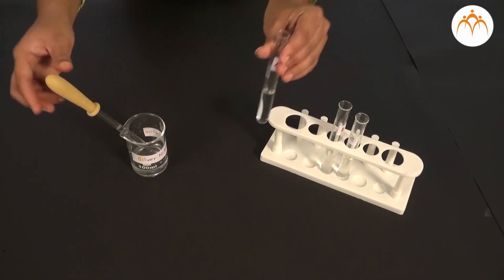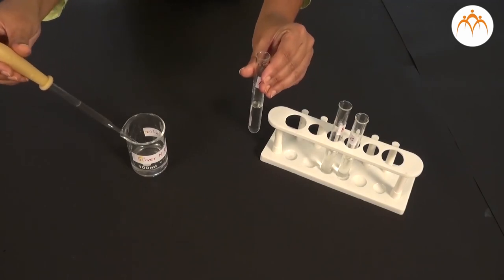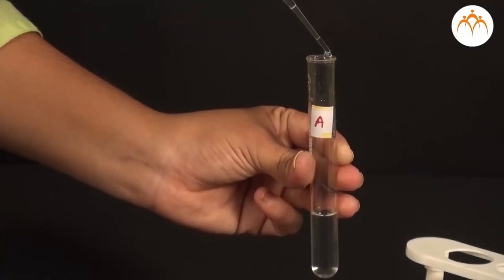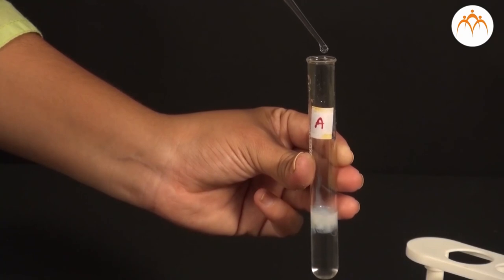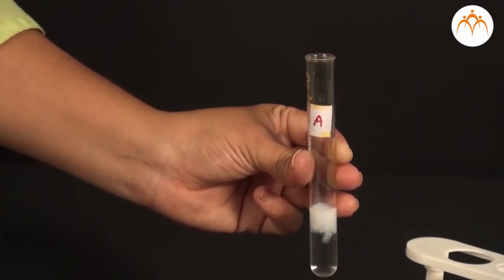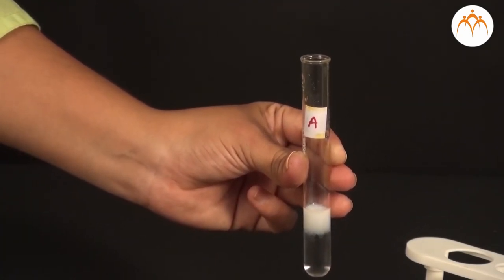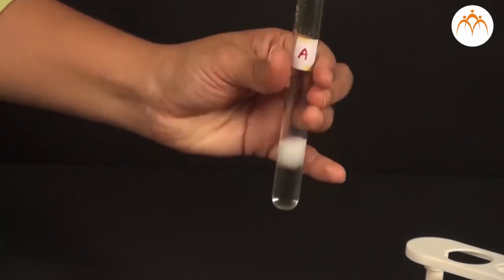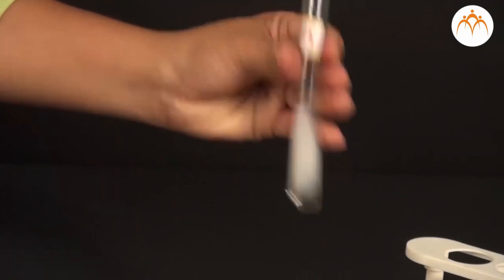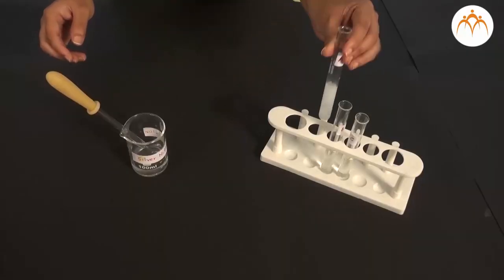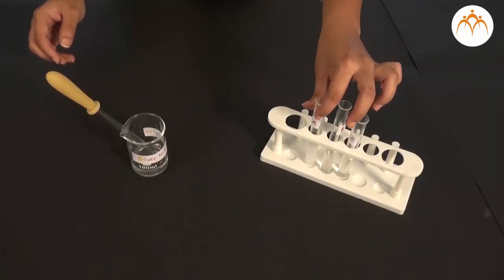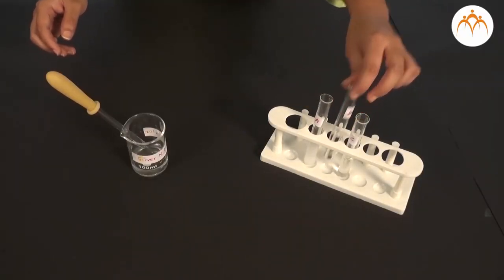Note down the observations in the table. As soon as you add silver nitrate, we find that chemical reaction starts and some product is developed. This product is not a liquid but it is solid. Such solid product that comes out of the solution is known as precipitate and the process is called precipitation.